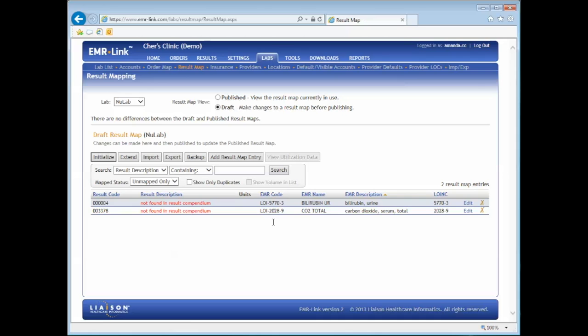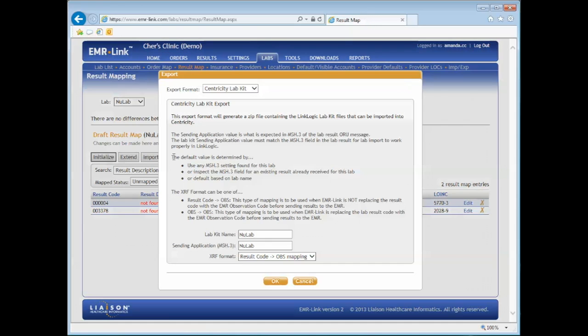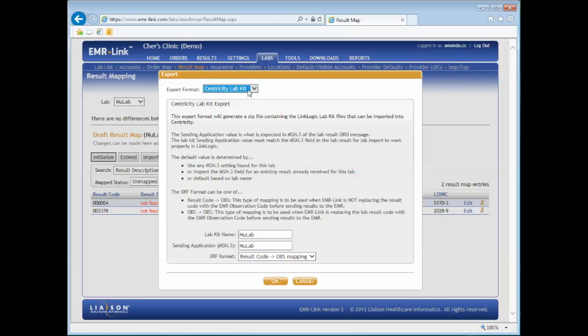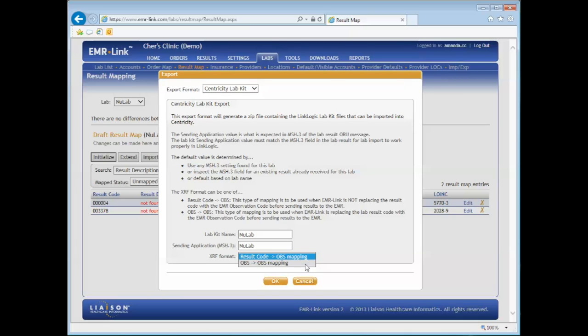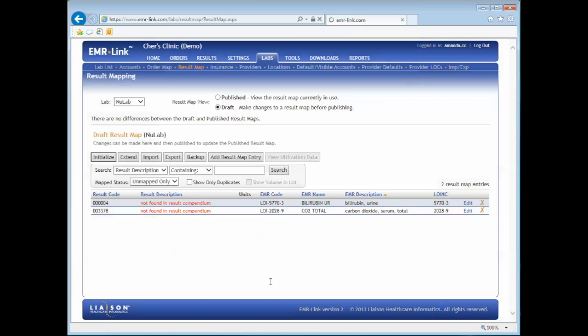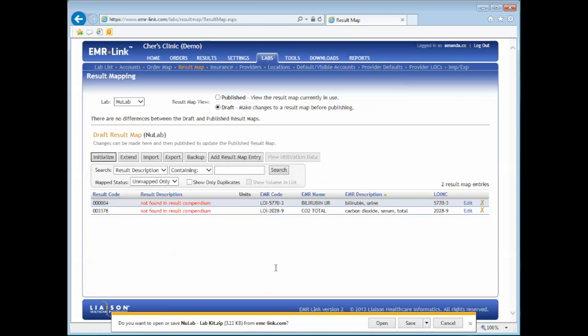Once you've finished your mapping and published it, you'll need to export your new cross-reference file. Click on the Export button. Verify that your export format is correct. Then make sure your lab kit name is correct as well. Select the cross-reference format which you like to use, either result codes to Ops Mapping or Ops to Ops Mapping. Click OK to export your new lab kit.